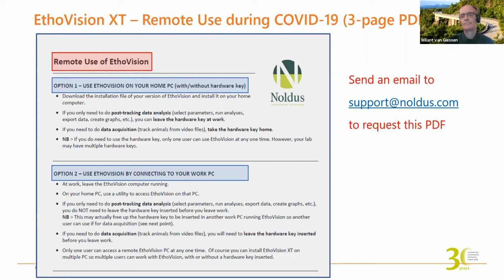Yes. Okay, and we have a comment that says that you can digitally mark different animals in the social interaction module. This works best when animals don't crawl over each other, when the digital marks might accidentally get exchanged. Yes, absolutely. Okay, quick couple more questions coming in on the Q&A.